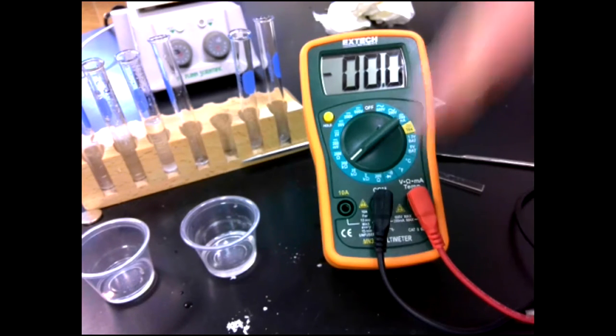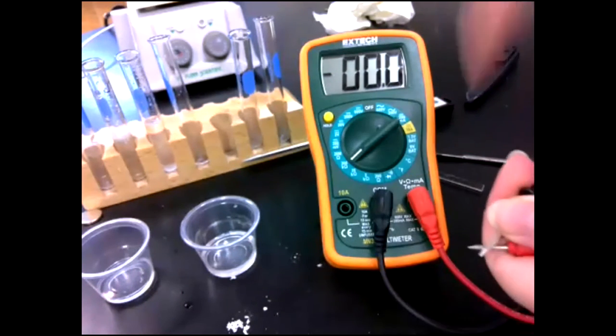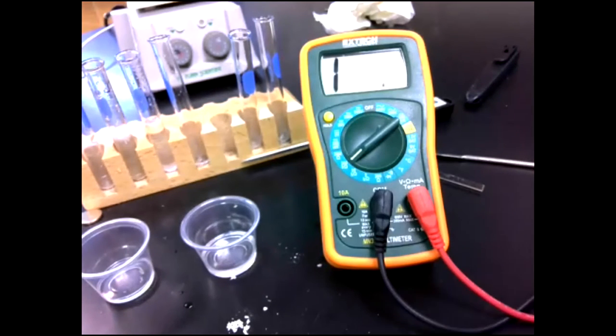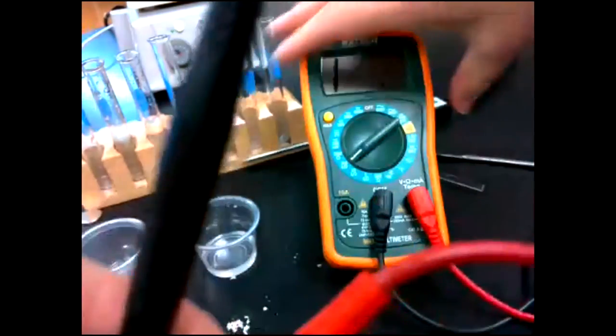Nothing that we do here is going to conduct as well as metal, so it's not going to go to zero. But if we get flashing numbers, if it doesn't stay on 1, then it's a yes, it's conducting electricity. So I'll do A first. So A is in water.